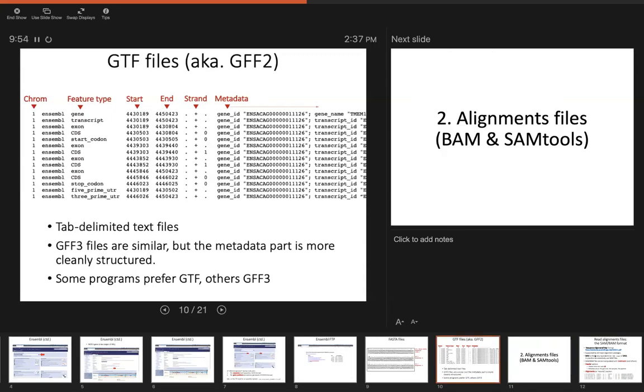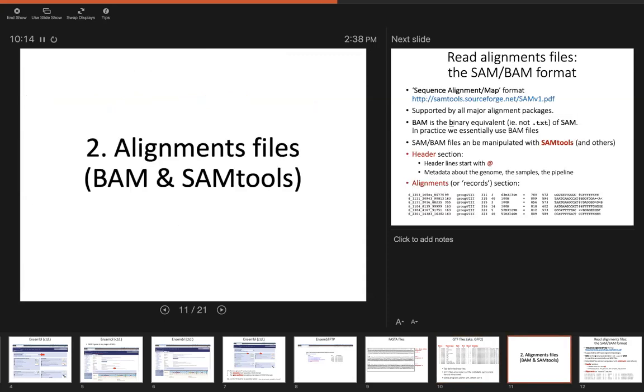Yes, do you have questions on this? No? Okay, so we're going to use this. I don't think we're actually going to use this today because I'm going to give you the simpler way. So we're not going to fully use it, but we could use it if you have time, if you want to. I'll show you.